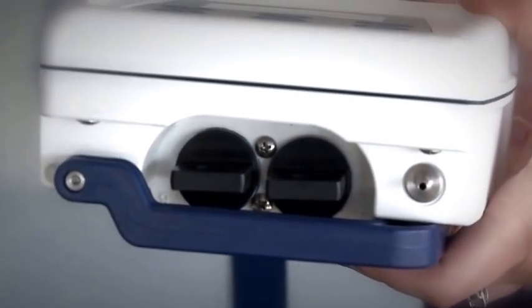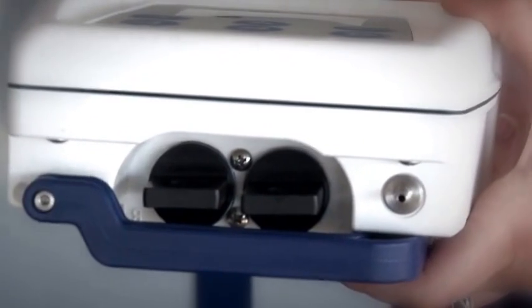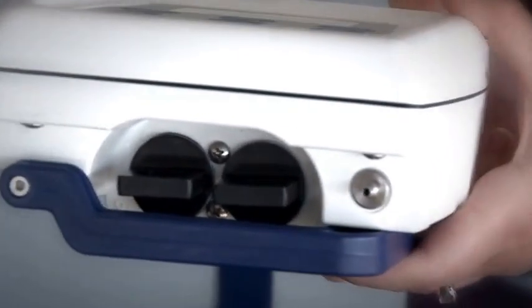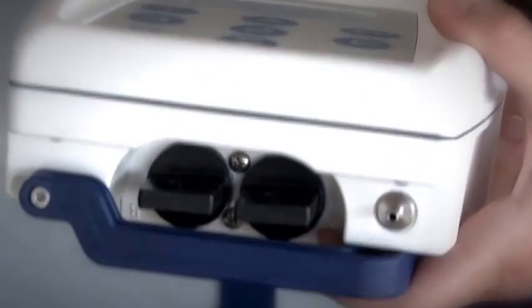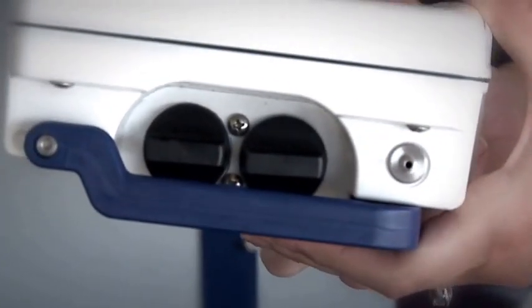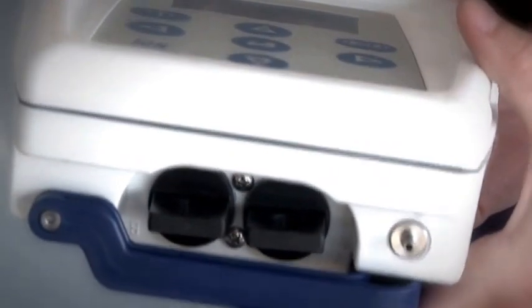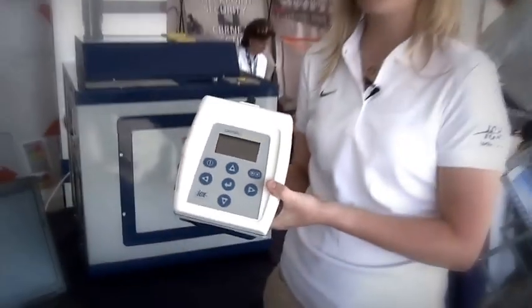You would want to sample on both tubes in cases where you want to keep one for a chain of evidence and the other for the actual analysis, which becomes very valuable. The Xorber can also take GPS coordinates and time, and you can sample based on volume, time, or manual.